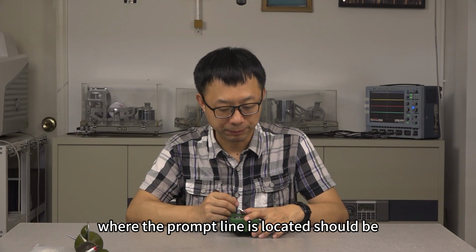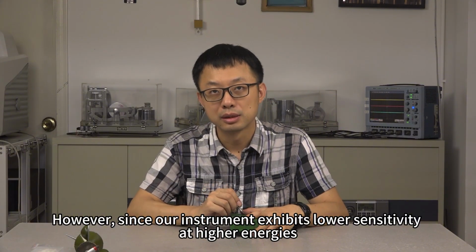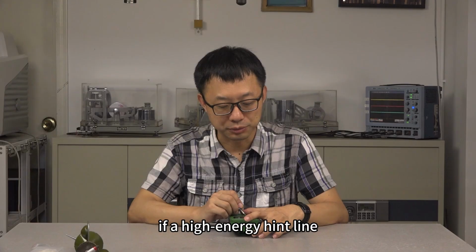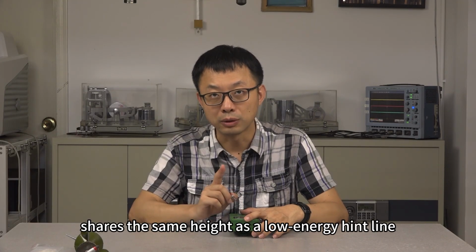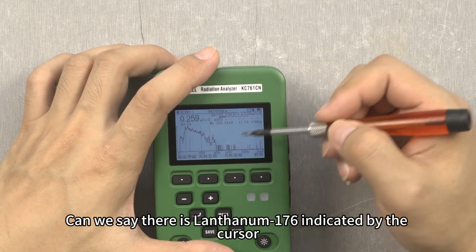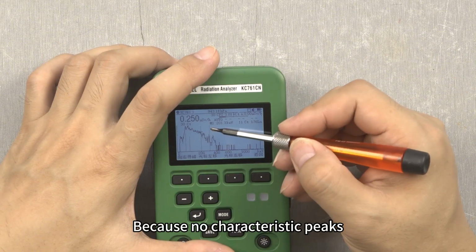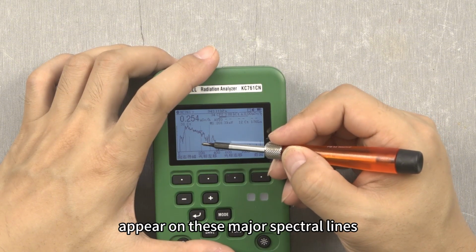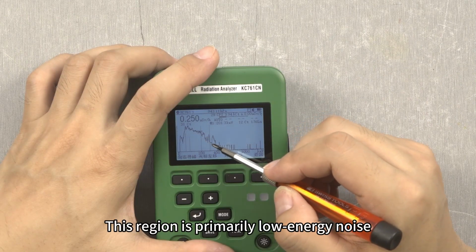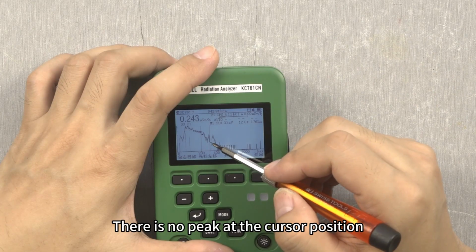However, since our instrument exhibits lower sensitivity at higher energies, if a high energy prompt line shares the same height as a low energy prompt line, high energy peaks are often lower than low energy peaks. Based on the current spectral lines, can we say there is lutetium-176 indicated by the cursor? No, because no characteristic peaks appear on these major spectral lines. This region is primarily low-energy noise. There is no peak at the cursor position.